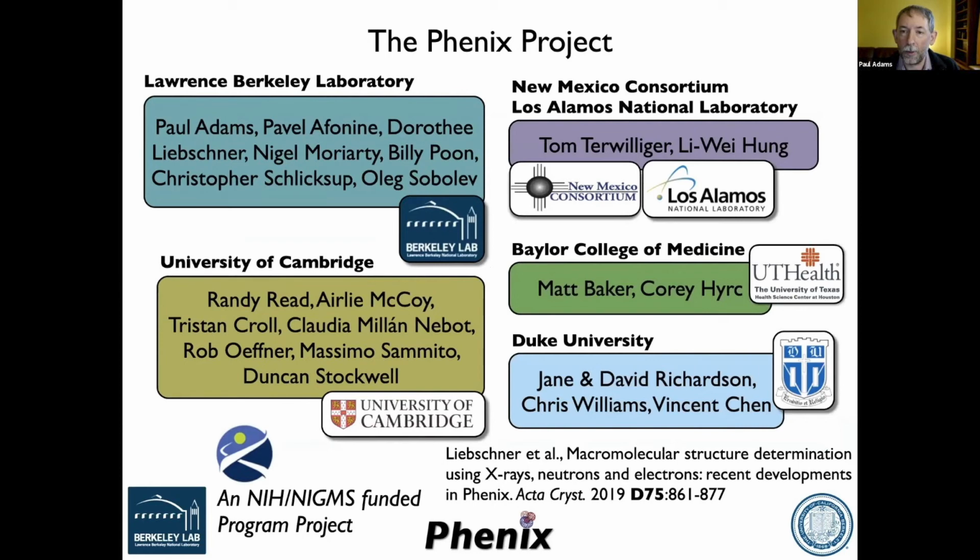Then I tried playing with the weight, from 1 to 5. At something like 1.5, I found the clash score really getting better, maybe close to 10, and the correlation coefficient is unaffected. All the Ramachandran outliers and everything are getting better. So my question is whether it is the right way to do that. Can we put the weight option in manually if we are getting better statistics and the map fit is unaffected?